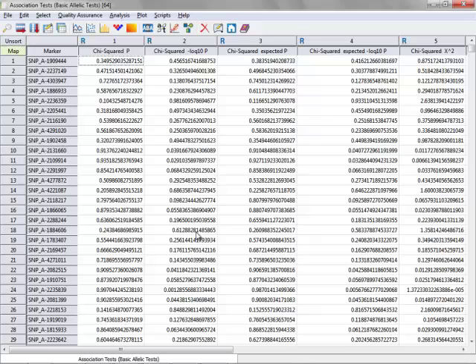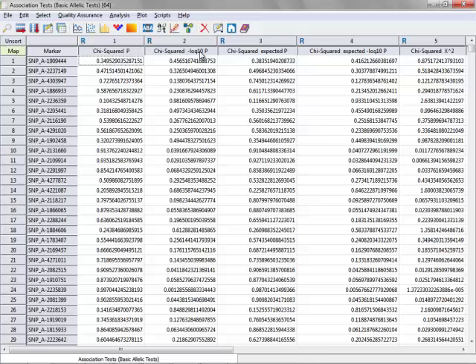From here, you want to check to see which SNPs are most significant in the association test. I can do that simply by right-clicking on this negative log 10p column and choose Sort Descending.